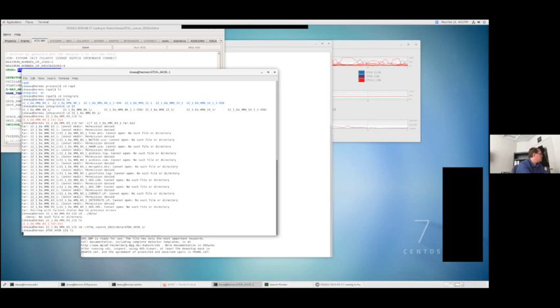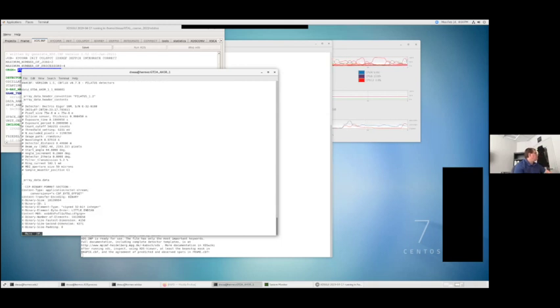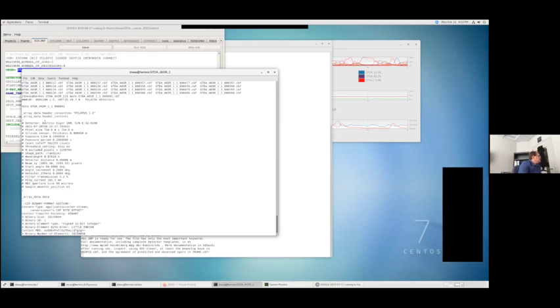All right, so this is the directory where my data set is. So I'm going to just more. This is the header. So in here, you can see that it has exposure time, it has detector distance, it has beam XY in pixels. It's got the starting angle, all those parameters. So that's one way to look at it as well.